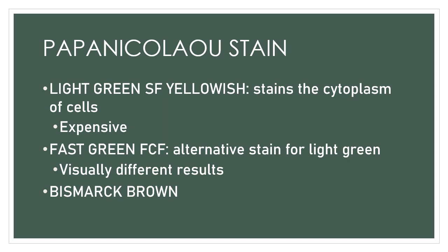Please read on the modifications of this Papanicolaou stain. The modifications are for the time, so please read on that. Okay?